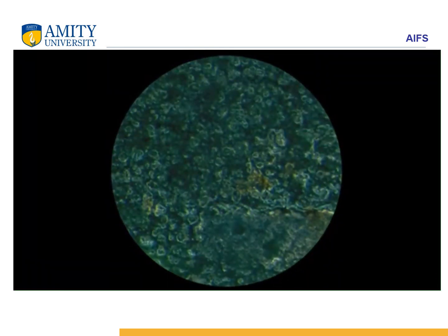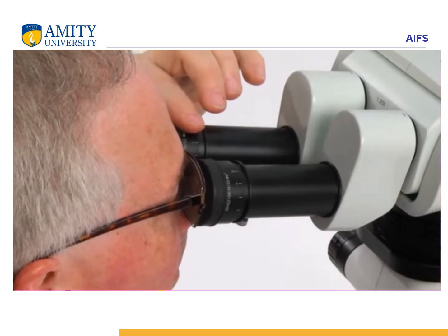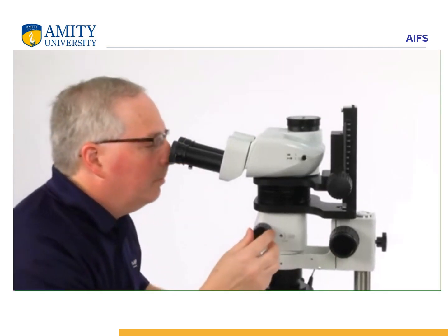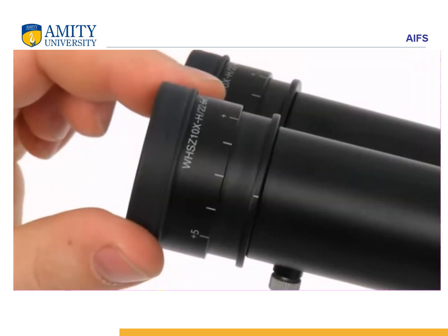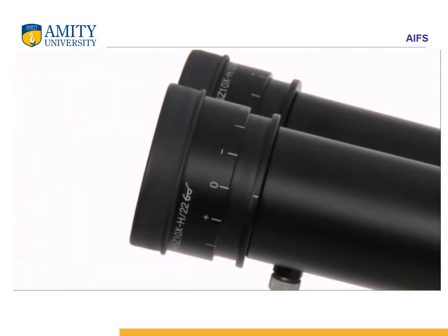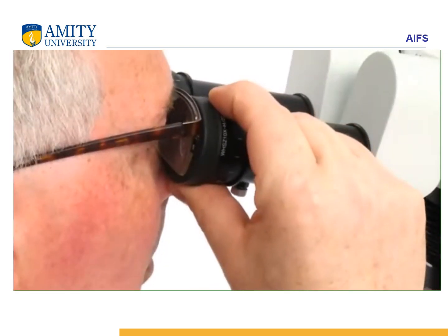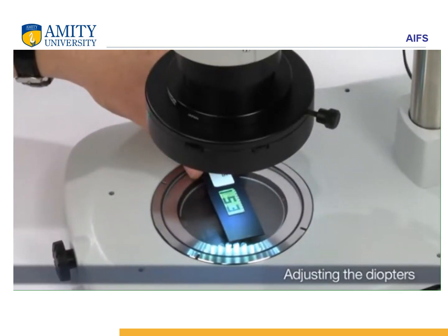Once you are adjusting the eyepiece with the help of the diopter, magnification is adjusted with the help of the diopter. So first you need to set it to 0. The diopter has to be set to 0. You can see 1.25x magnification is there. You'll set both eyepieces to 0.